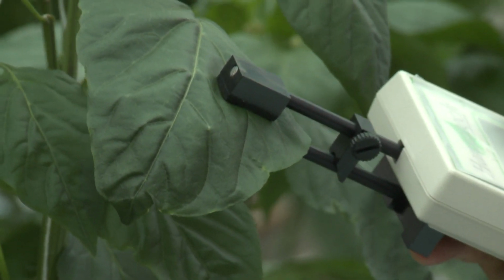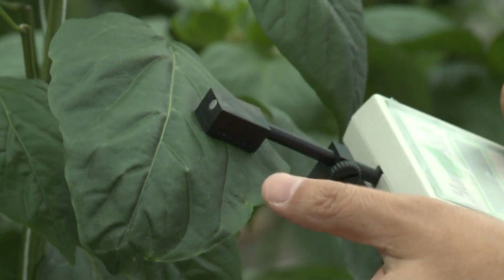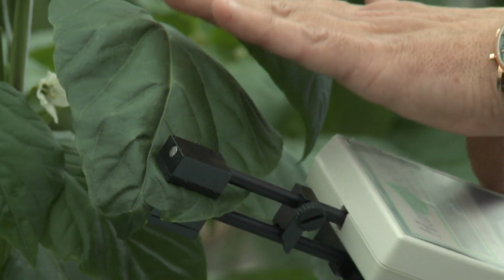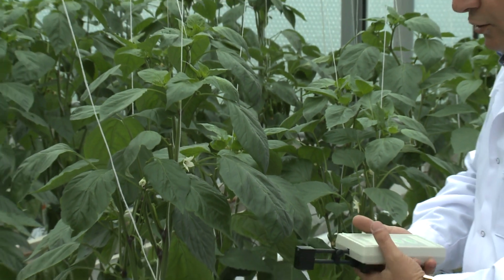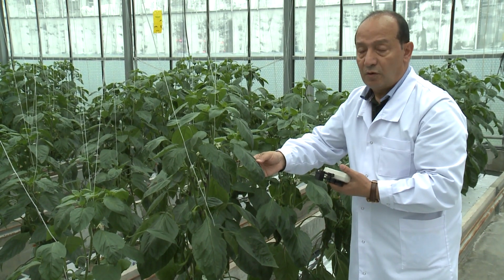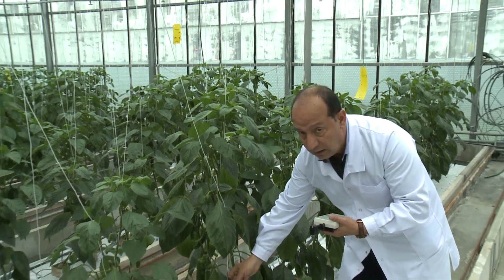However, if my measurements should be very precise, I would take measurements in the middle, on the bottom, and on the top of the leaves, and I will take the mean value of the whole leaf. Now, if I would like to make measurements for the whole plant, it's better to take leaves representing the young leaves, the average or moderately grown leaves, and the old leaves.